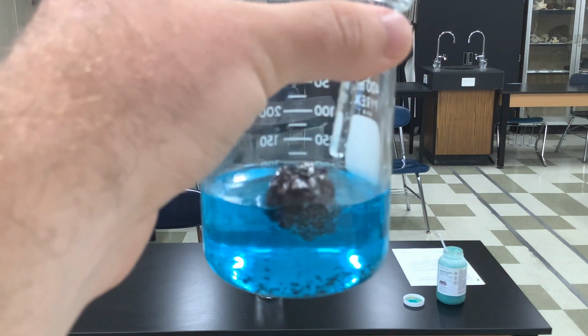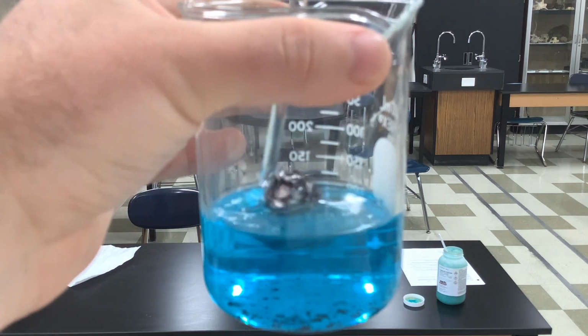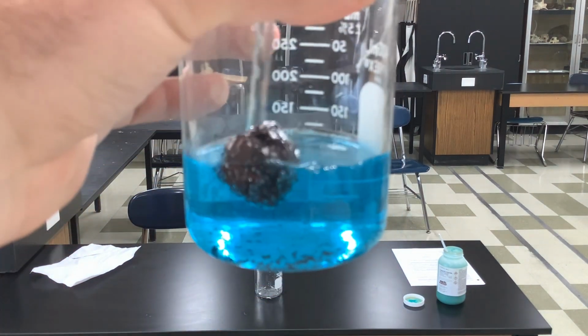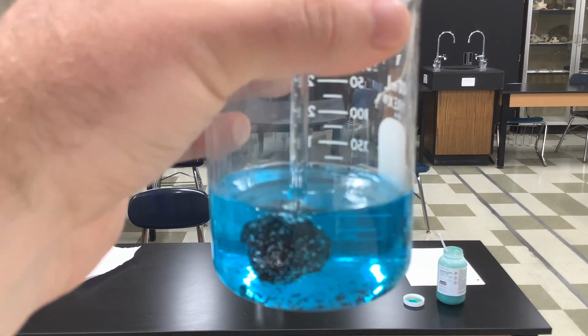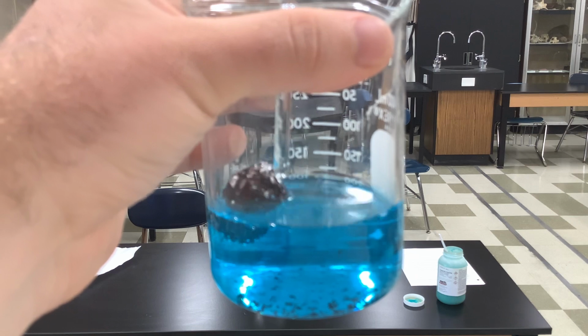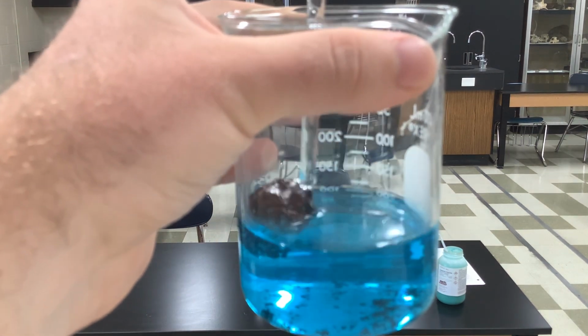And you can see that it's starting to look brownish at some spots. The color is changing. All this debris down at the bottom. You can see it's fizzing. I don't know if you can hear it online, but it's fizzing a little bit.